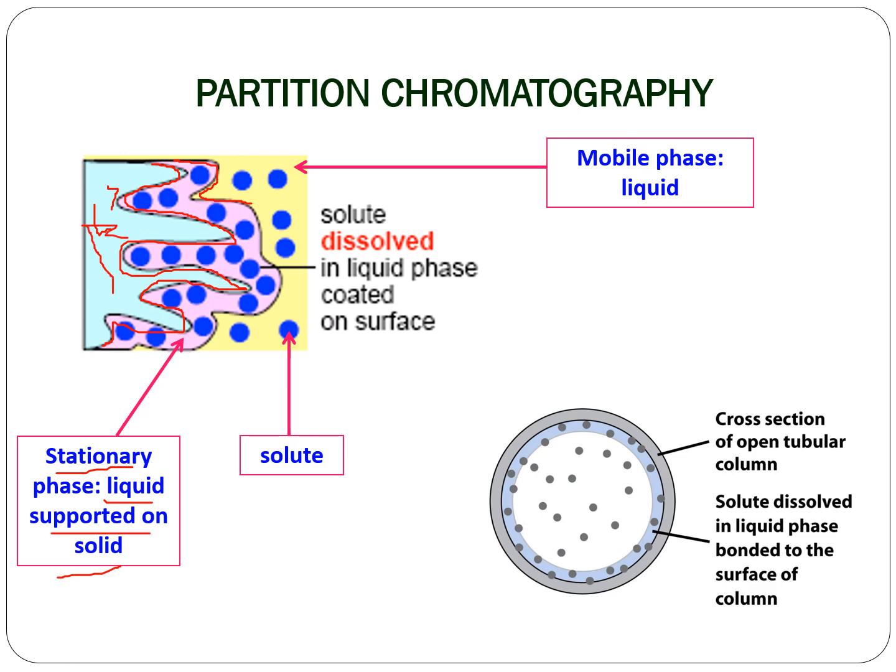Okay, so contoh kata dalam normal phase kita punya stationary phase ni adalah polar. So polar component dalam kita punya ni akan retain dalam kita punya polar stationary phase. So dia akan elute paling lambat lah. Manakala non-polar component dia tak akan pergilah dekat polar stationary phase ni, dia akan elute faster.